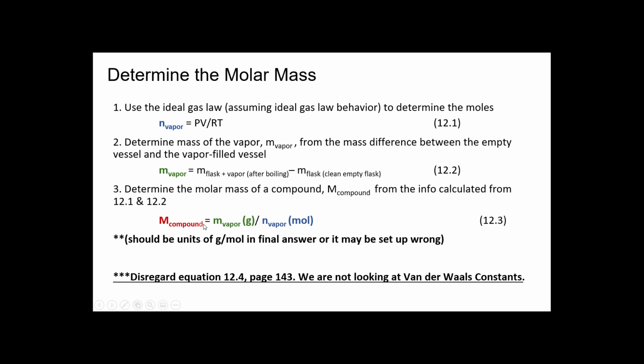Then one more step, very easy. Remember what molar mass is? It is grams over mole. You're just going to plug these in and determine the molar mass of your compound. Now keep in mind, these slides are directly from my lab. I don't know if Entis has changed anything on Canvas.